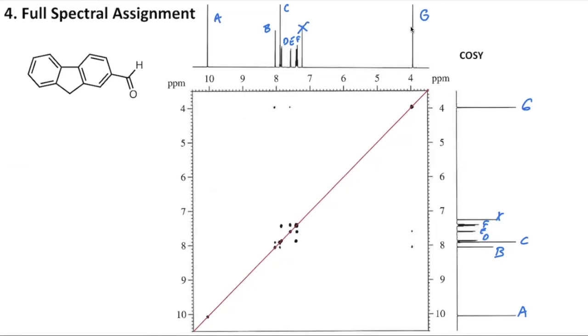So now we can see the things that are just totally cut off and we don't care about because they represent an identity coupling of something to itself. We can just ignore them. Everything else, though, we can't ignore. We need to make sure that we take account of it. So what I'm going to do for this, as I have in previous examples, is draw a thin straight line and then move them over so that I can see the cross peaks.